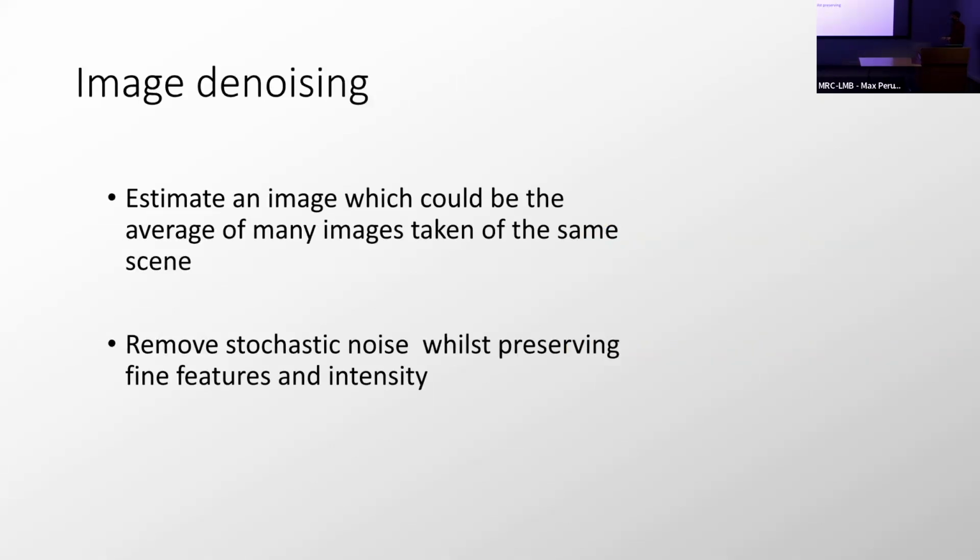Now we might want to remove this noise or try to reduce it. So now we understand what noise is. It's a random fluctuation of one pixel. Here we have a very specific kind of semantic. We don't say noise is all we don't want. It's just this kind of noise.